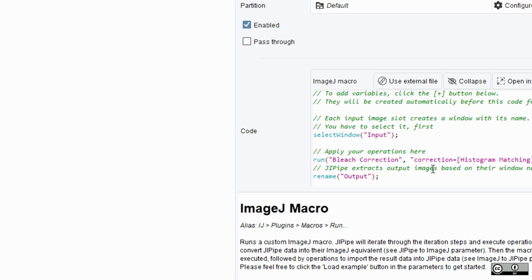It can also be fluorescence images where you start bleaching the data. The point is that if I want to quantify intensities, I should not have this intensity change over time. This is called bleaching correction. It measures the intensity of the image at the beginning of the time series, measures the intensity at the end, and then linearly interpolates between these two values and corrects the intensity of every time point so that the average intensity is flat.